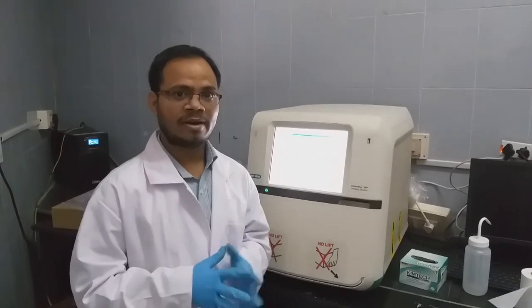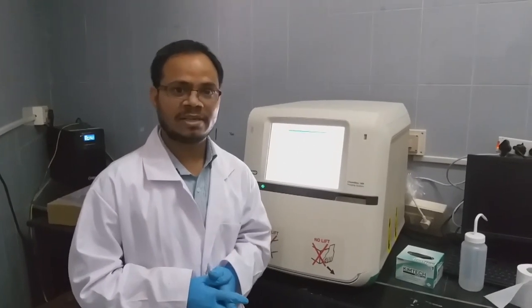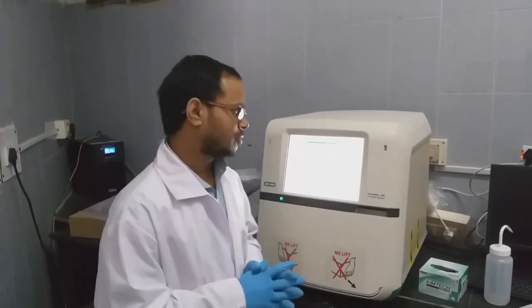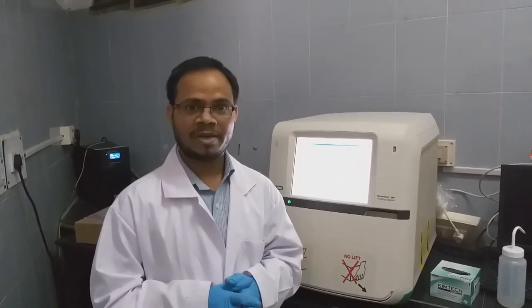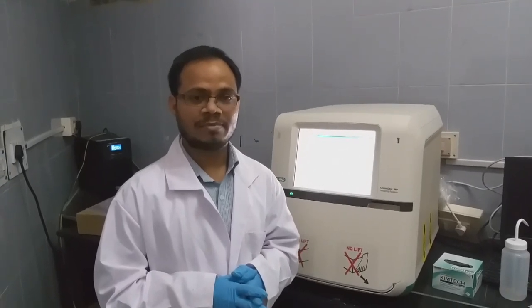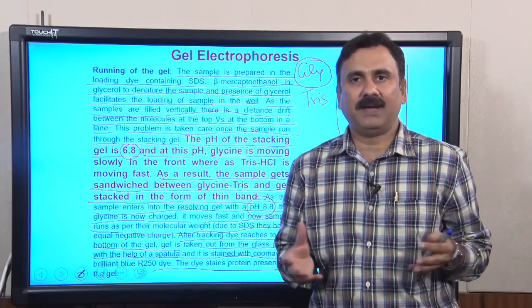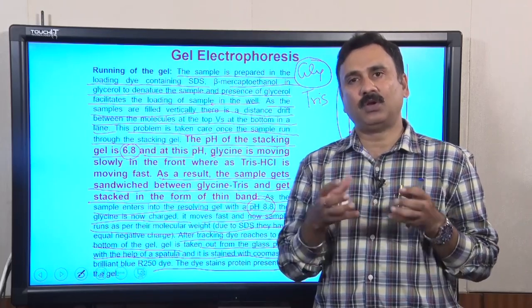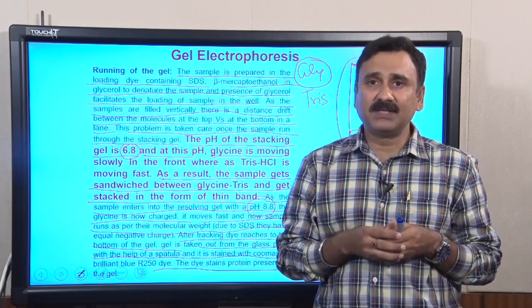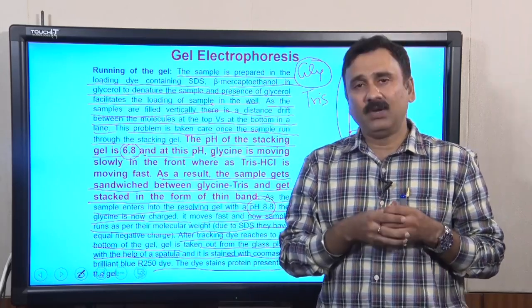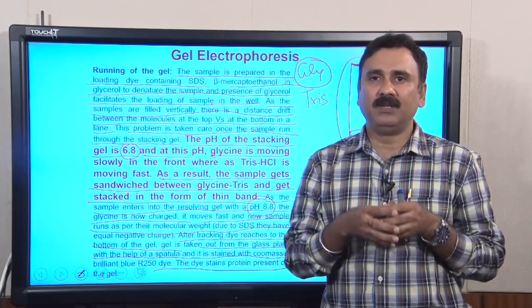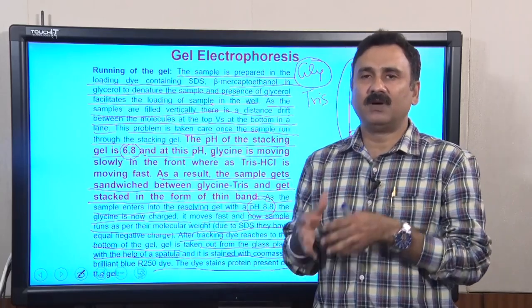In this video we have learned how to prepare an SDS-PAGE gel, how to run it, what precautions to take while preparing the gel, and how to record the gel using a gel documentation system. In the upcoming video, image analysis will be demonstrated to determine which band corresponds to which molecular weight using Image Lab software. The demo covered by students from Dr. Trivedi's lab provides a practical guide to preparing, running, and analyzing protein samples on polyacrylamide gels.